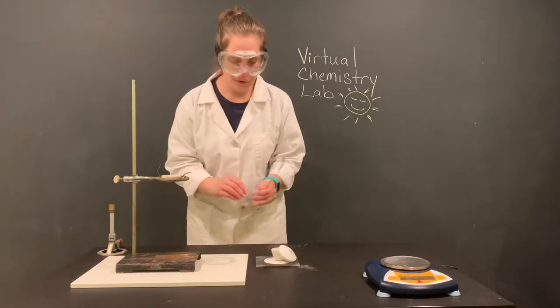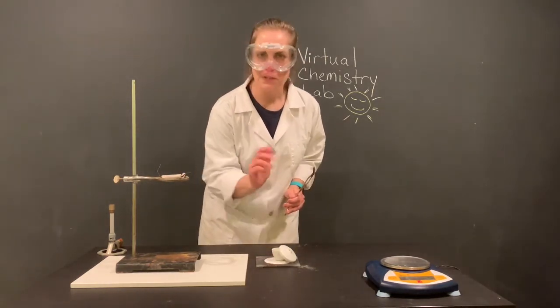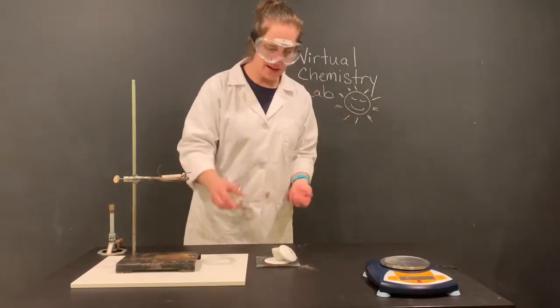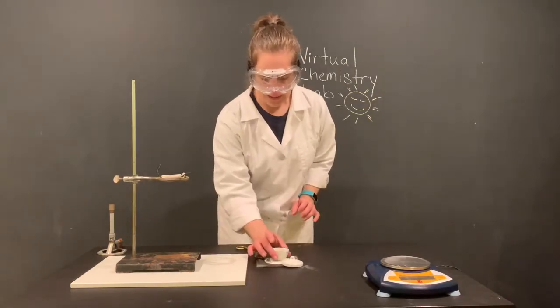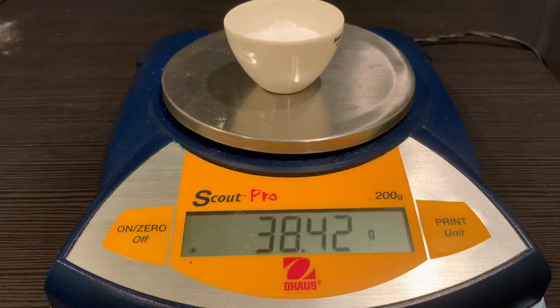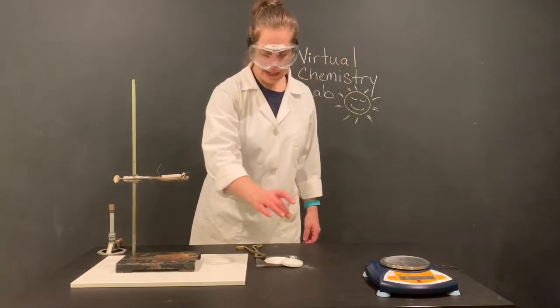The next test, of course, is just to do the sort of gently touch it. Is that hot? Just like you would do at home. So at this point, however long it's been, I've decided it's cool enough to touch. So I'm going to bring this over, and I'm going to pick up my crucible, and I'm going to take the mass again. So now we have our recorded mass after our first heating.